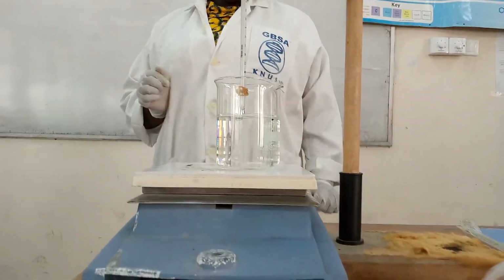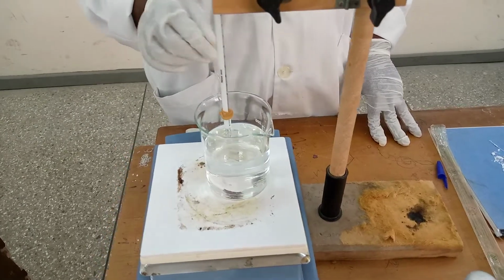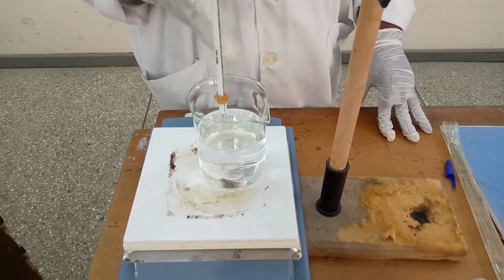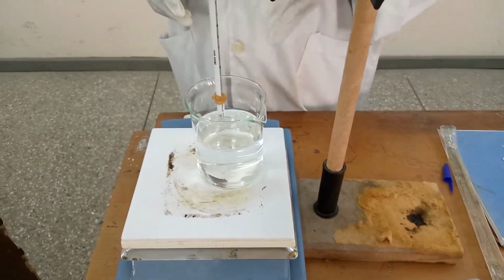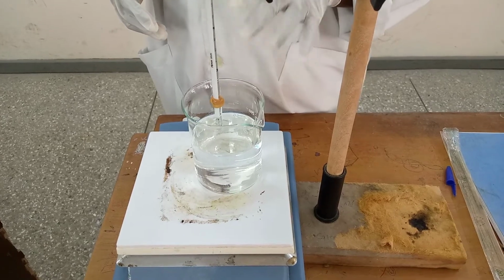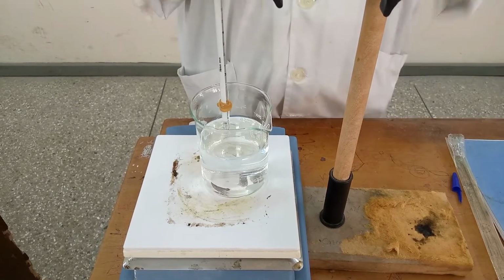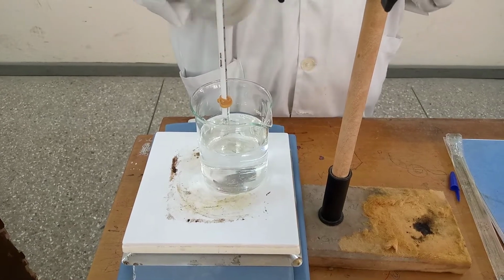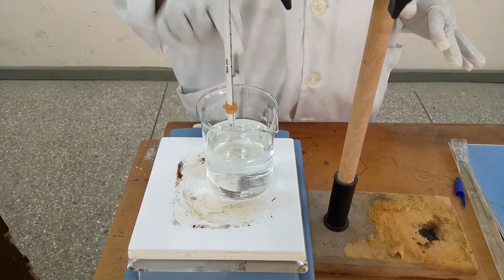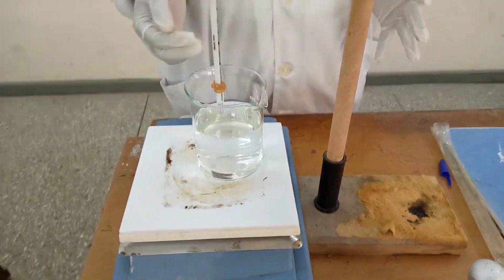All right. So now the range, we have to report the melting point in a range. So the temperature at which the sample in the capillary tube starts to melt, and when it's finished melting, you have to record it. Now somebody will ask me, how will you know if the sample in the tube starts to melt? Now when I showed it to you, it was whitish in color. When it begins to melt, you see something like bubbles coming out from the tube. And when everything finished melting, you see that the tube will be colorless. That is how you will know that the sample is melting in the tube.